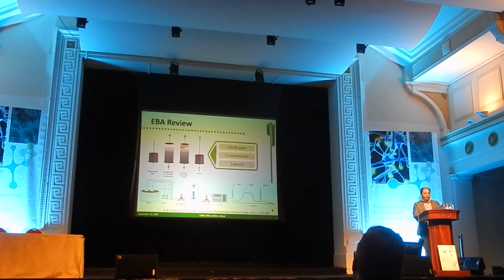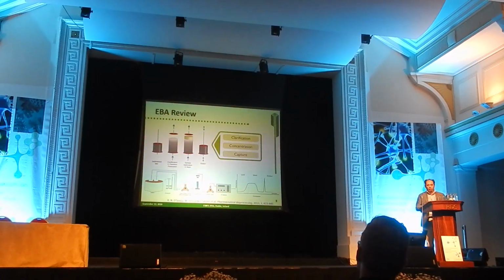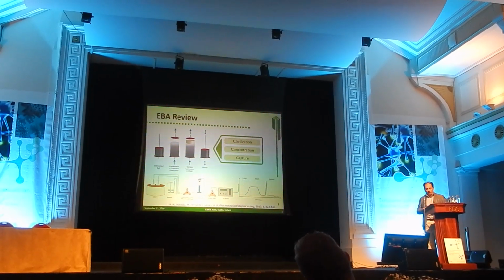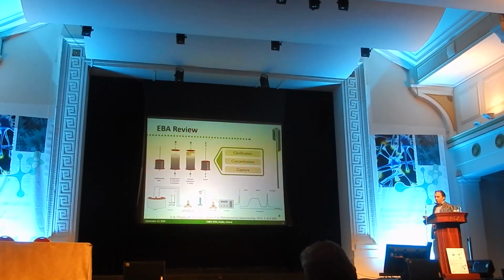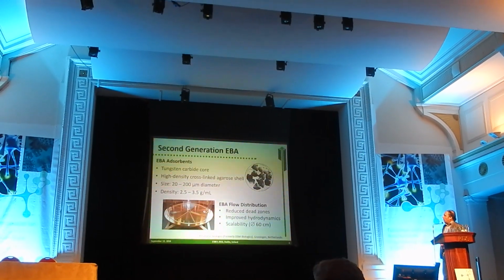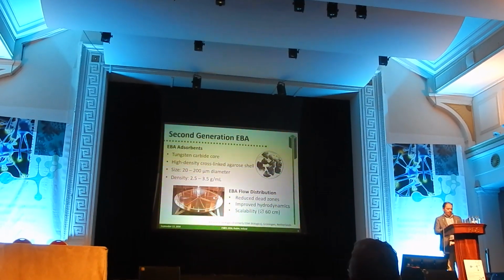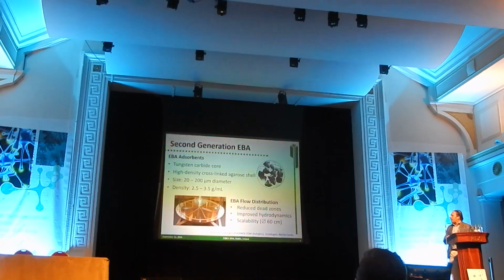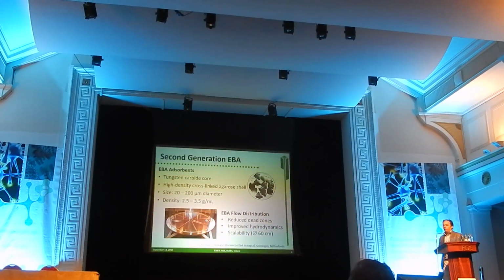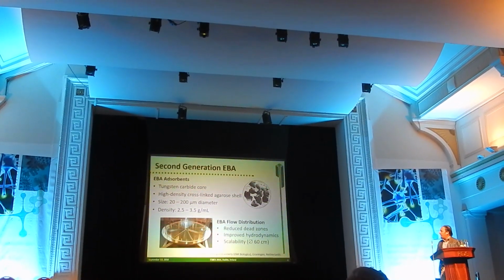This is an on-off chromatography, so you will be loading up to saturation, you will be washing, and you will be eluting one single peak, which is supposed to be pure due to the selectivity of the adsorbent. Now, in the last years, this technique was introduced in the early 90s, and we already noticed at that time some degree of trouble with the technology, especially with the stability of the fluidized bed.